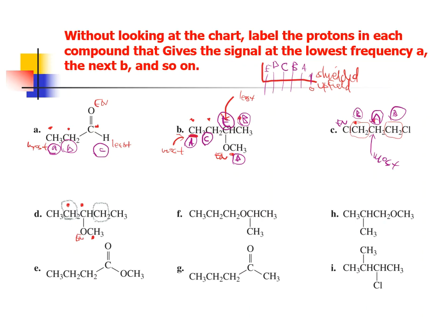All right, now next is this CH3 group, and of course, ding dong, that is going to be different. That's a CH2, that's a CH. This is a CH3 group, but that's on an oxygen, and this one is not on an oxygen. So that means it is not equivalent, it is different. So what I'm going to see in D, I'm going to have to label an A, B, C, and D, because there are 4 different signals that are associated here.